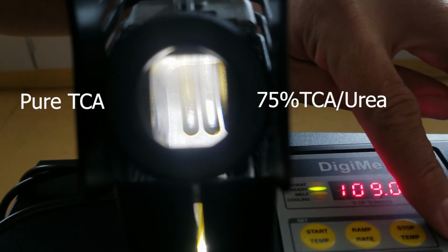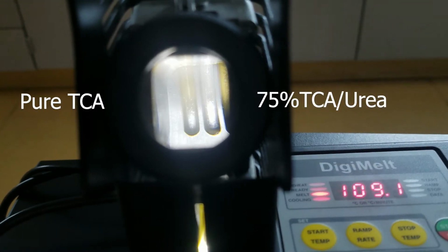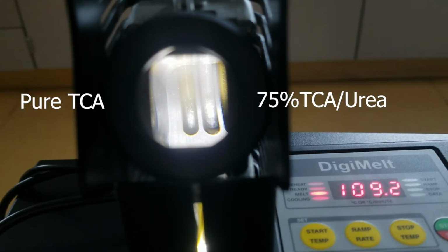And let's start it. Remember, you want to record a T1 and a T2 the best you can. You want to look at the point where they start to melt, and then when it's fully melted. Looks like we're already almost there. At least the one on the right.